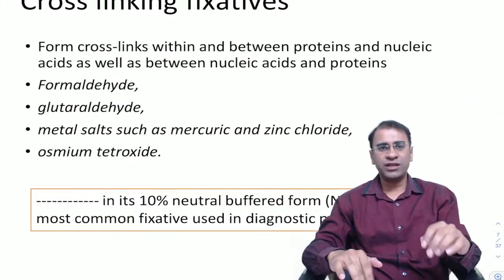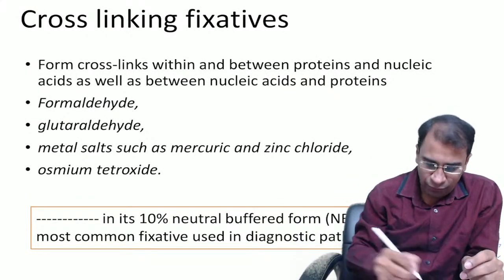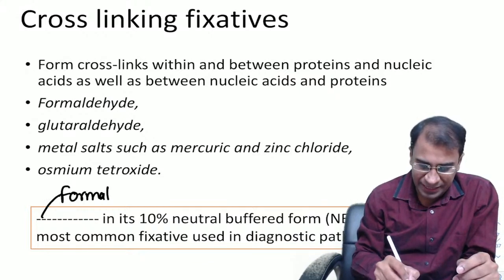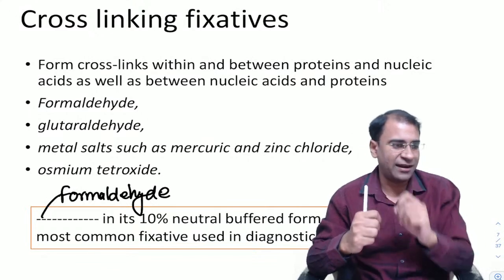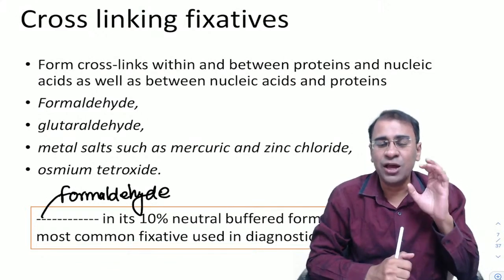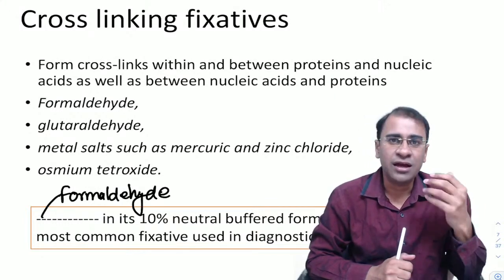The answer to this question is, I hope many of you are correct. Yes, it's 10% formaldehyde. Formalin. Formaldehyde. Very, very good. Very correctly answered by Avinash Mukherjee, Megha Tyagi, Chandrika. Exactly. The answer is formaldehyde, the most common fixative used in tissue histopathology.